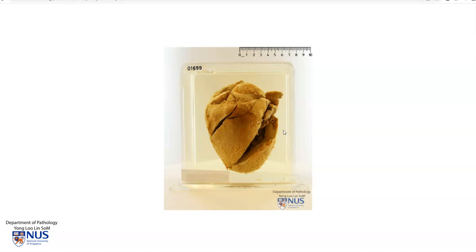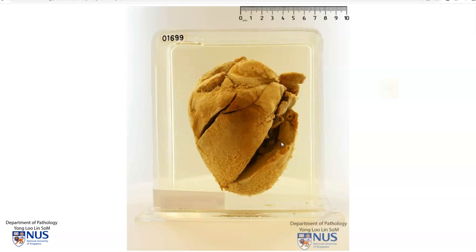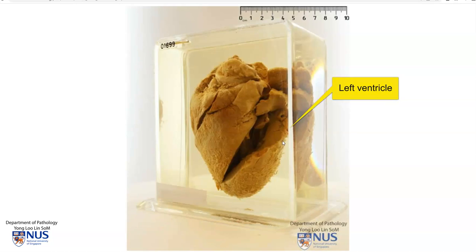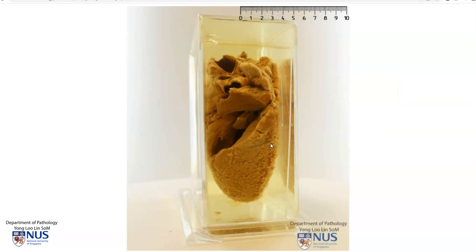Hello, this is a virtual pathology specimen of the heart and here we are looking at the anterior surface. This chamber is the left ventricle. You can see that the wall is quite thick. Here again you can see part of the left ventricle wall and this is the atrial appendage.